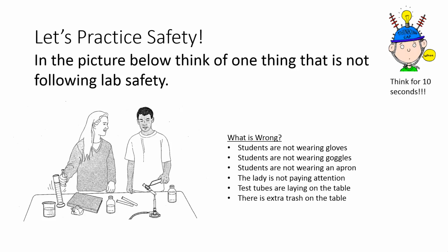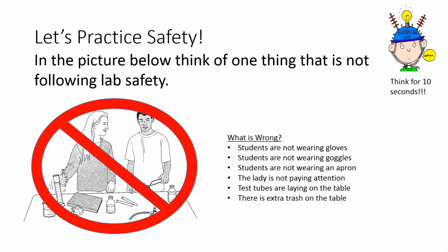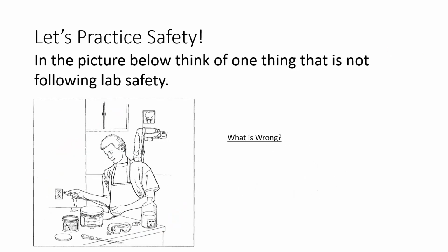There's also extra trash on the table. If you notice next to the book, there's a wadded up piece of paper. If something shouldn't be there, let's make sure it's not in our way. This is not what you call a safe lab.